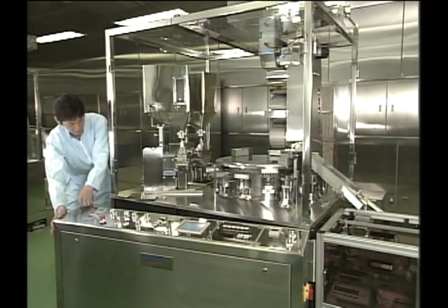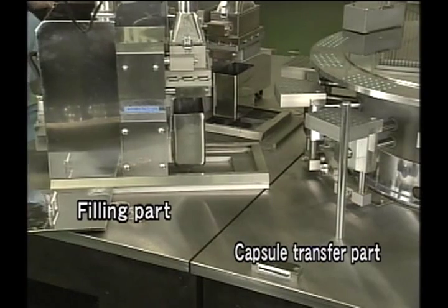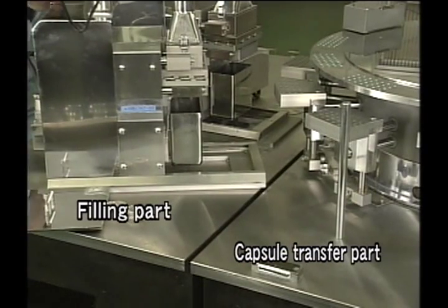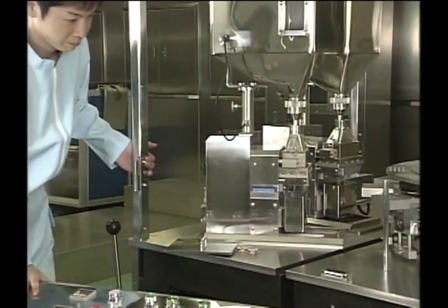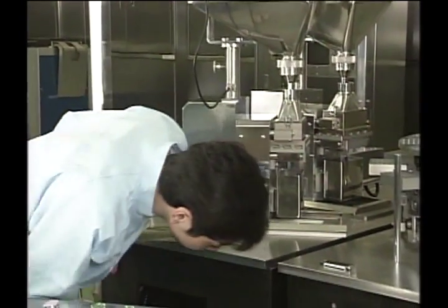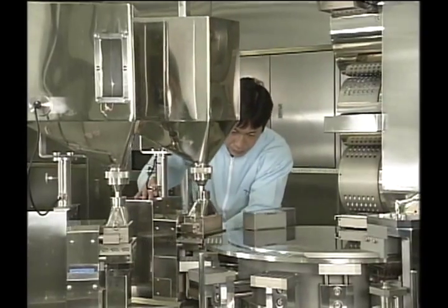This LiqFill Super 80 is a divided filler in which the transportation unit is separate from the filling unit for capsules. For example, in the case of manufacturing granules, this machine permits us to disassemble, clean, and reassemble the powder filling unit, thus greatly improving the operation ratio of the filling machine.